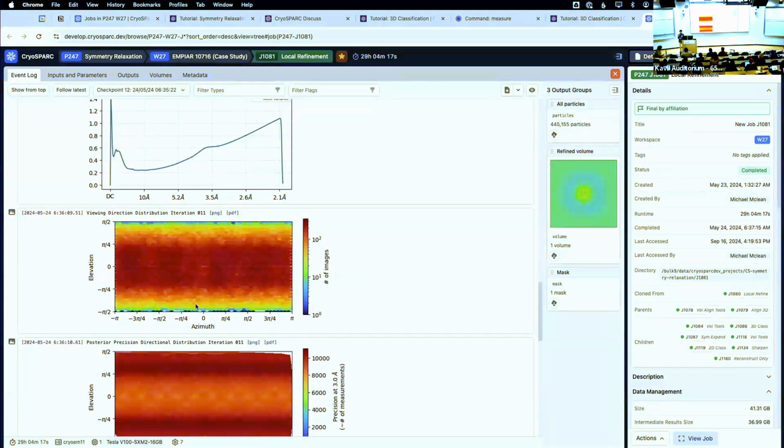But it is interesting that the overlap didn't pose that many problems. I think before we went to the single ferritin, it was fine because we were still modeling the whole tetrahedron. But you're probably right that we could get even better results if, now that we have this aligned structure, we went backwards and subtracted it from all of the other particles. But my brain hurts when I even think about that. It could improve things, but I was like, okay, we got 2.7, it's fine. But yeah, good question.